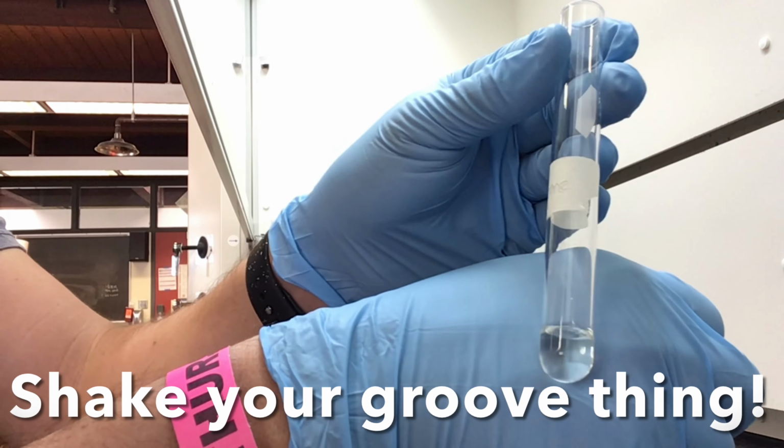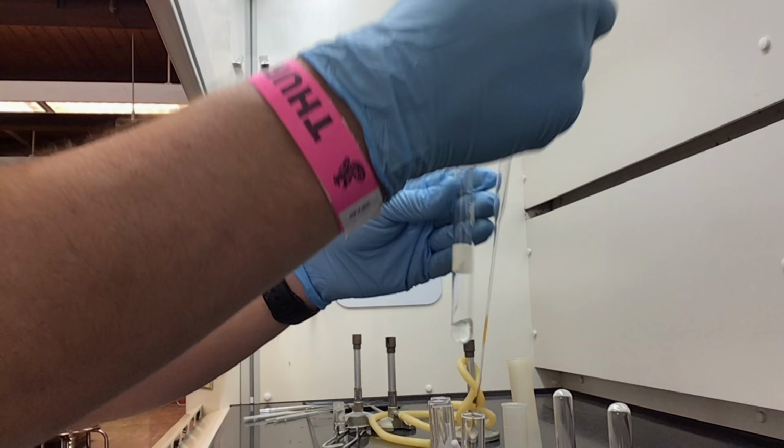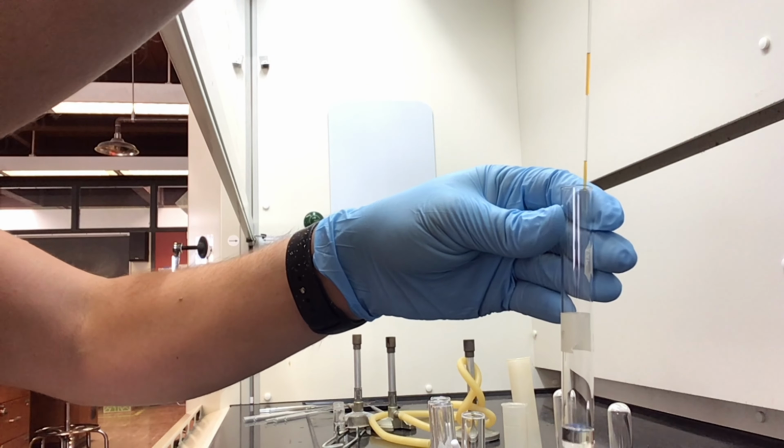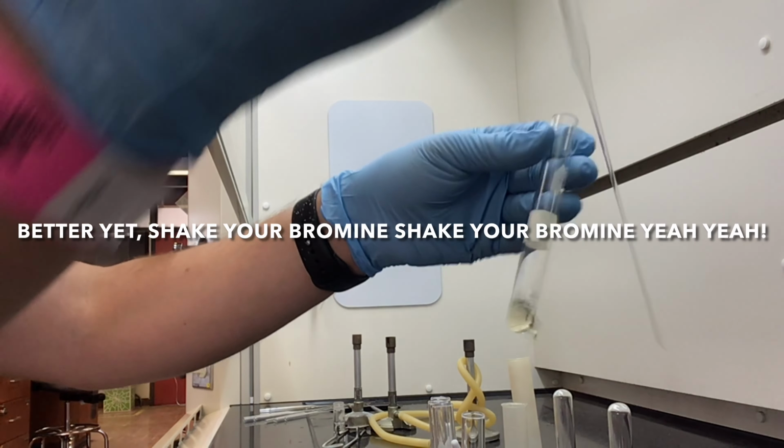So all I'm doing here is just adding more just to make sure that we're good, right? I always gotta, and maybe see how much I can add. How reactive is this compound, right?